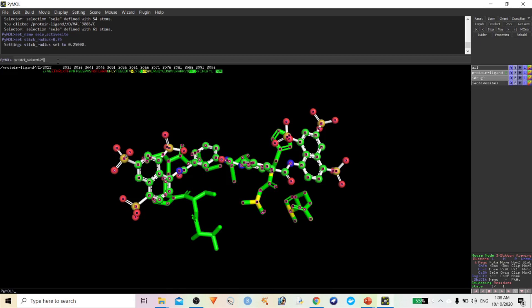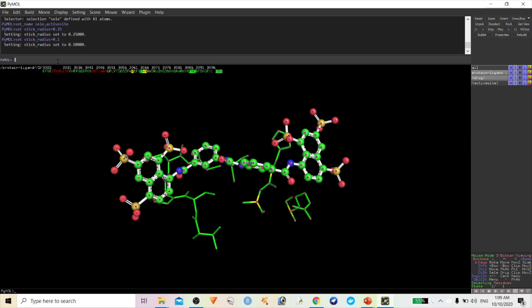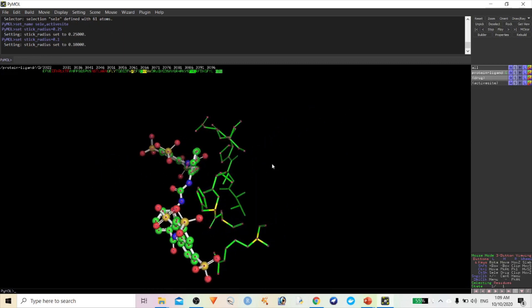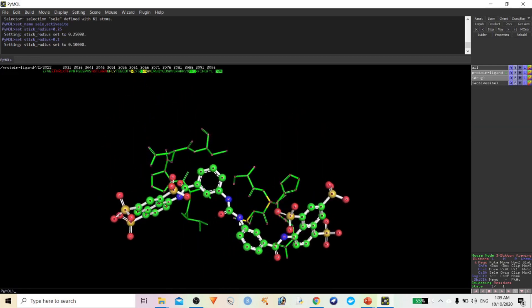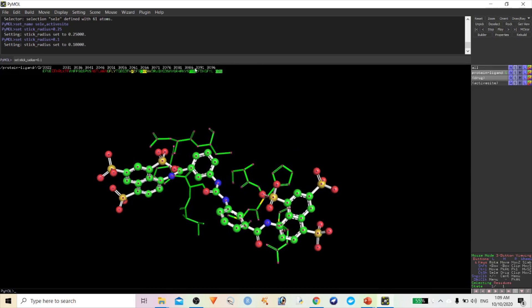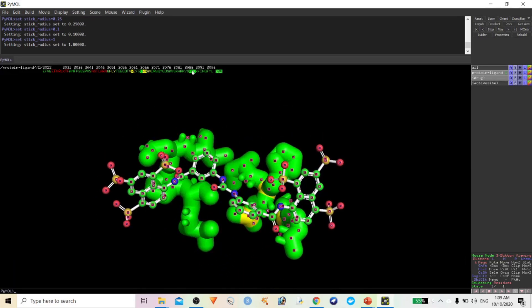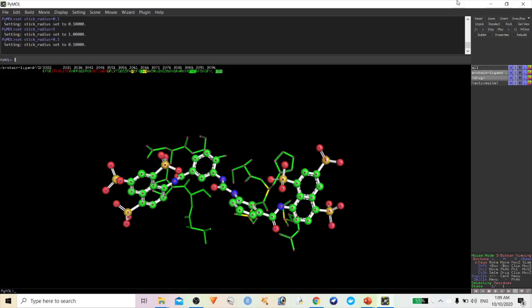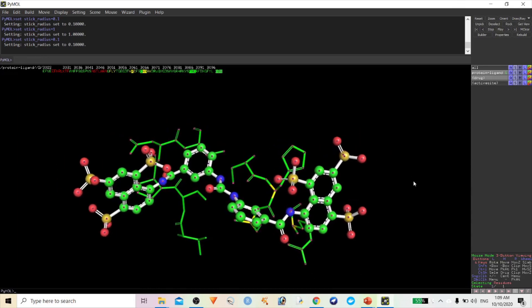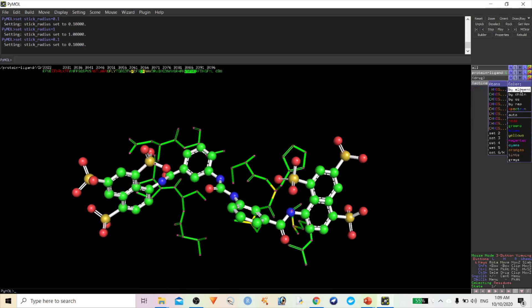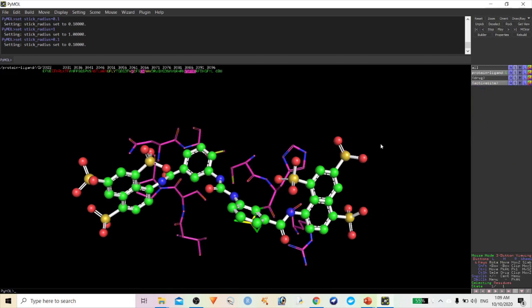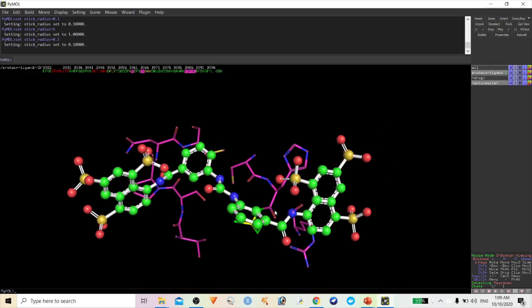You can see the radius of the sticks has been changing. If you increase, say to 1, the radius increases — but that looks very odd. Let me type 0.1 — this looks very good. We'll also color this by element.